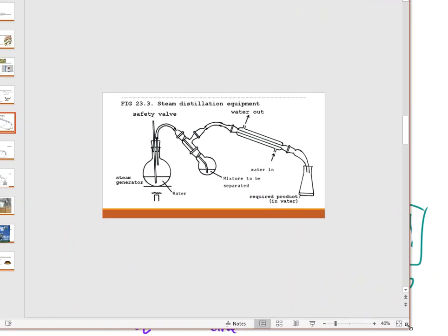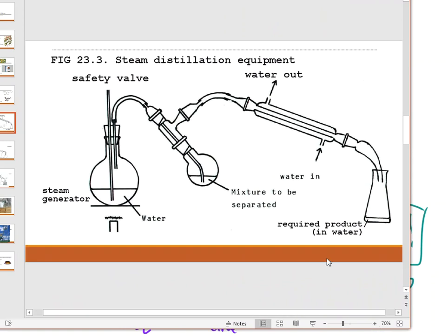Here in this slide or this picture, this is what your normal steam distillation will look like. So here in this flask, we've just got water. We're going to heat that up, and that vapor is going to come over into this middle boiling flask, and that middle boiling flask is going to have your clove and some extra water, and that's going to be heated as well, and that eugenol is going to turn into a vapor, and then it goes over to this side where the condenser is, and that condenses it back down into a liquid, and you'll have a receiving or collection container over here. So you'll be getting the water and you'll be getting the clove oil both.